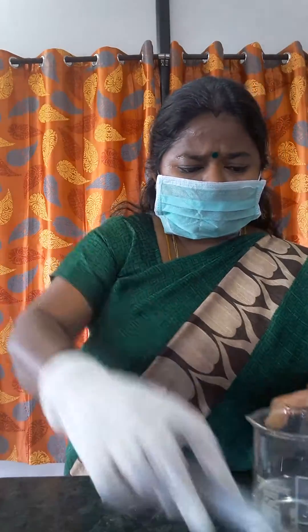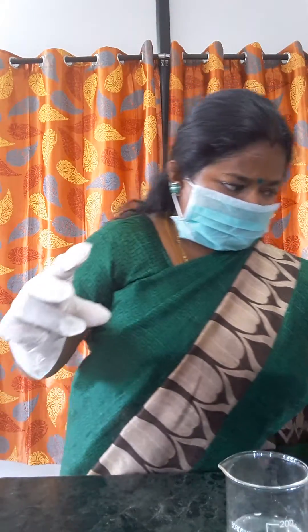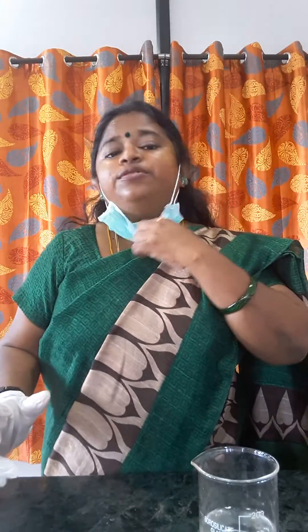This is the safest way to make it. Then you can mix it. This is how we need to prepare dilute sulfuric acid. Thank you so much for watching this video.